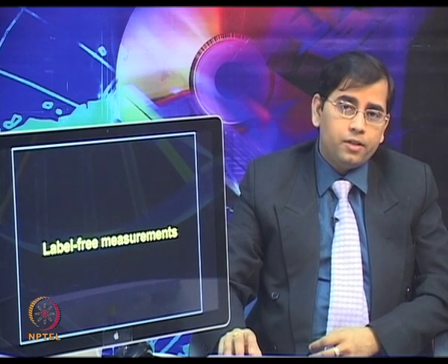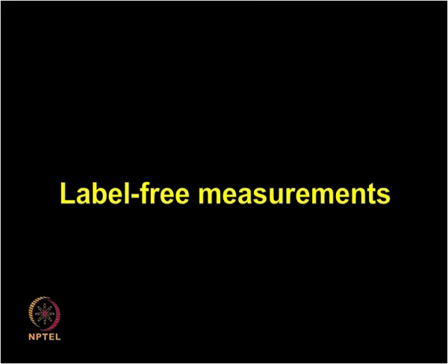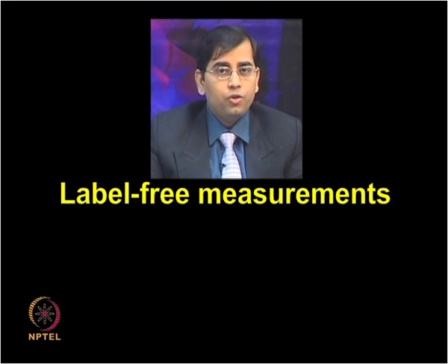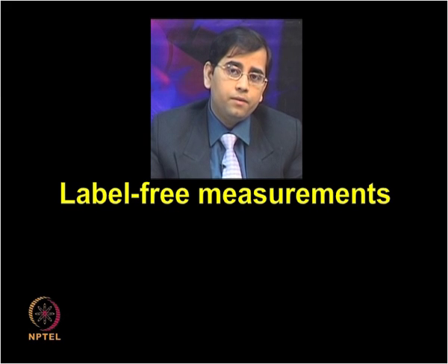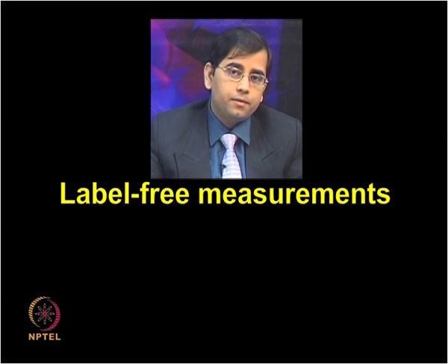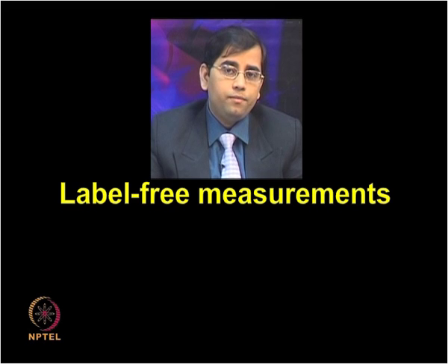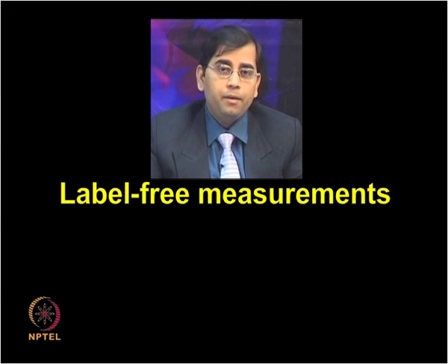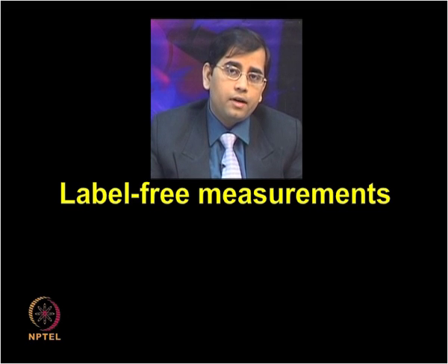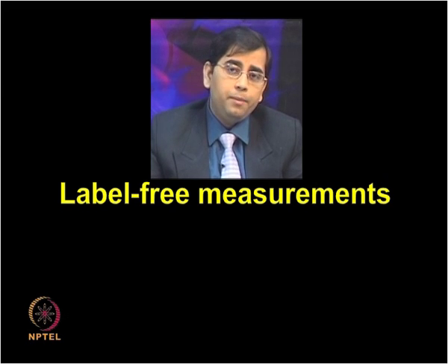So, now let us focus on the label free measurements. The label free techniques rely on measurement of inherent properties of the query molecules such as mass and dielectric property, and it allows the direct real time detection of biomolecules in high throughput manner, which eliminates the need for addition of secondary reactant, which is the case for label based detection techniques.